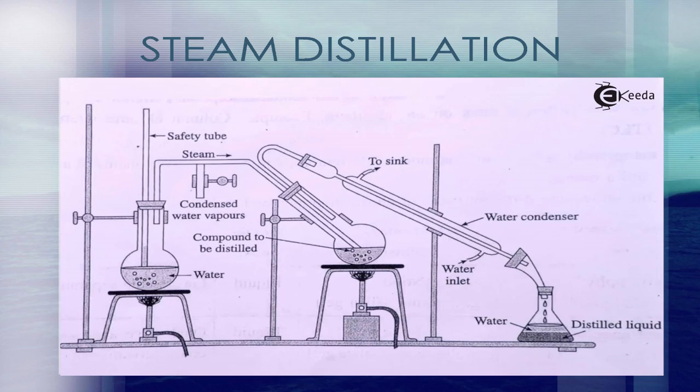Steam distillation of various aromatic herbs and flowers can result in two products: an essential oil as well as a watery herbal distillate. The essential oils are often used in perfumery or aromatherapy, while the watery distillates have many applications in aromatherapy, food processing, and skincare.